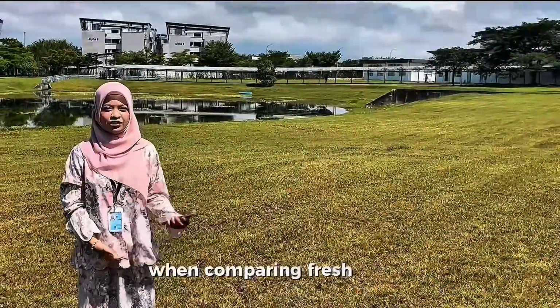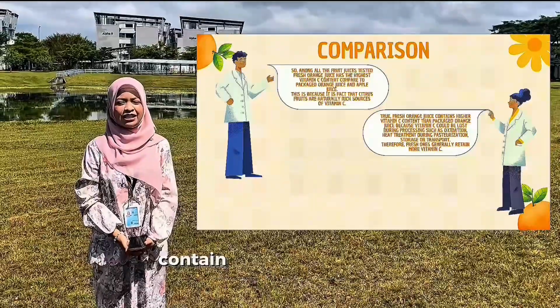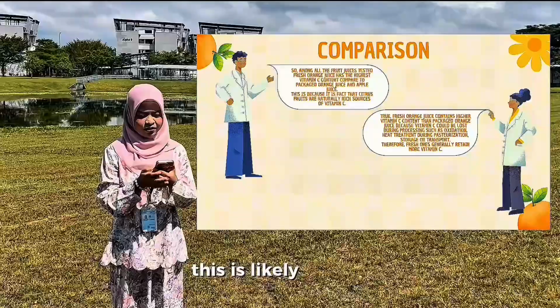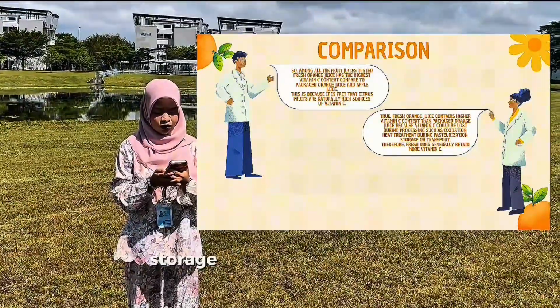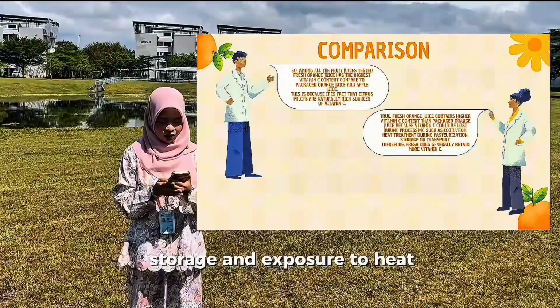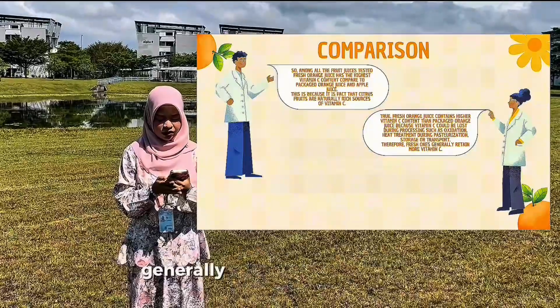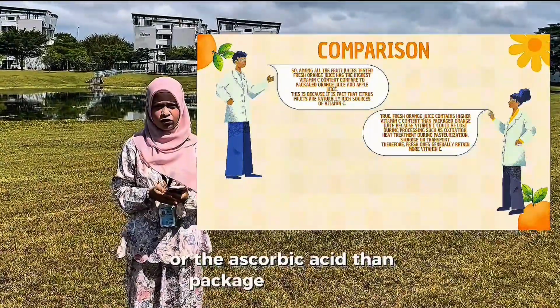When comparing fresh orange juice and packaged orange juice, the fresh orange juice contained higher vitamin C, or ascorbic acid, content. This is likely because vitamin C can be lost during processing, storage and exposure to heat, light and oxygen. Therefore, fresh orange juice generally retains more vitamin C than packaged orange juice.